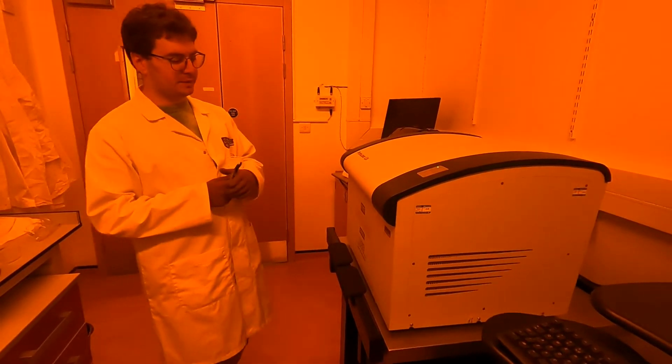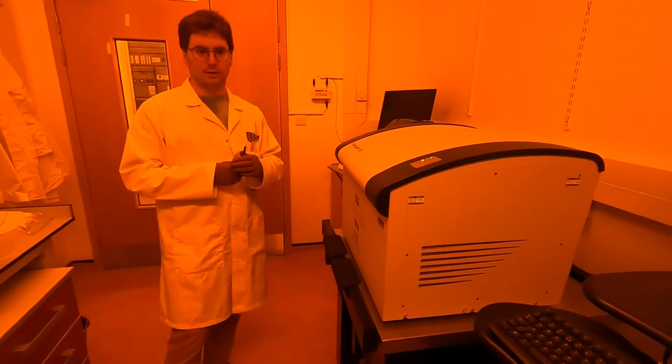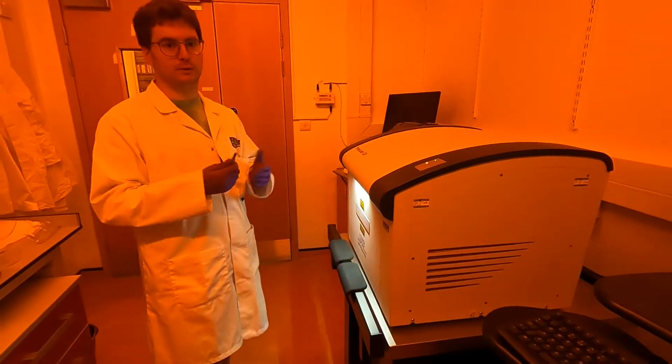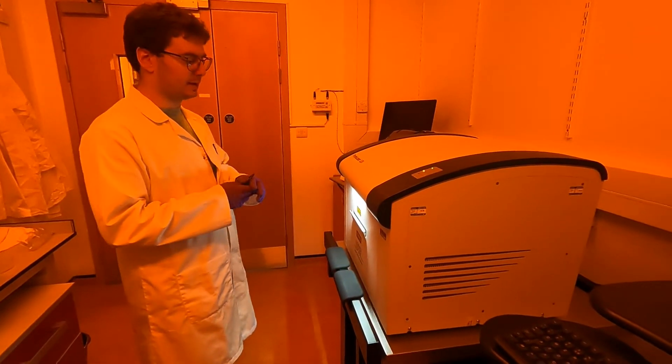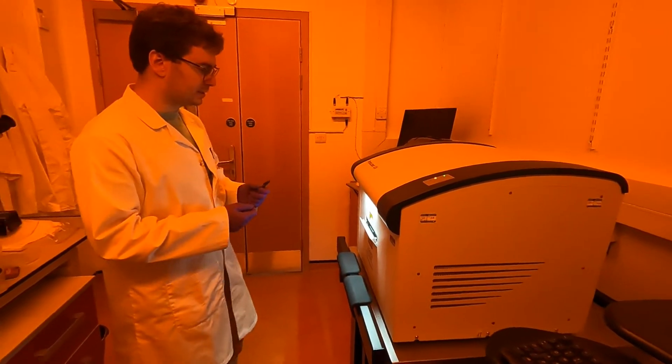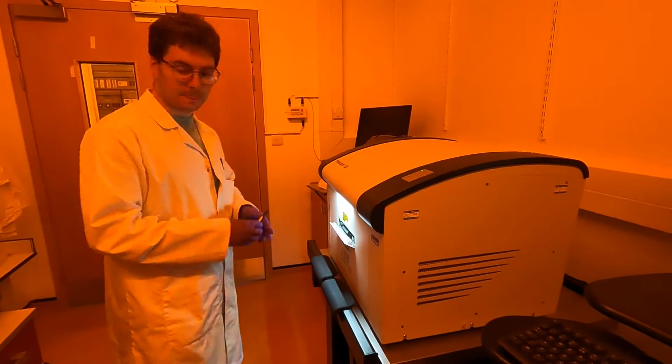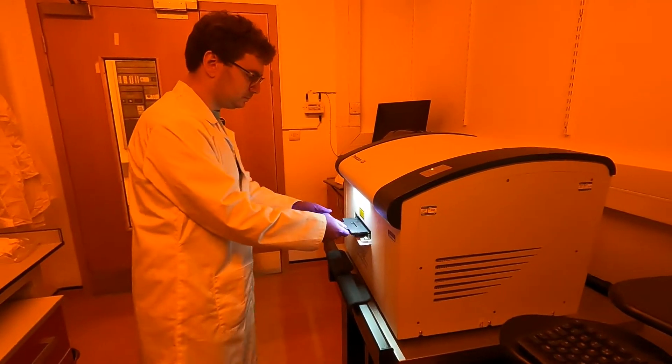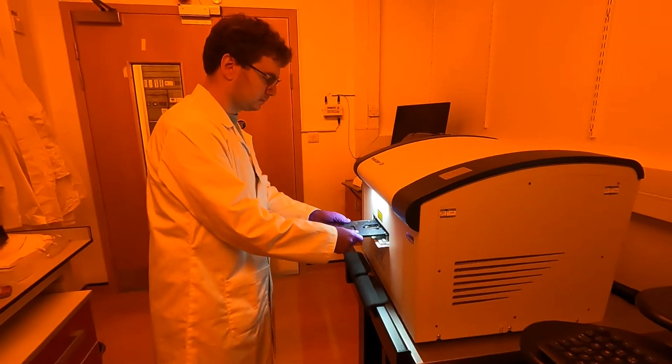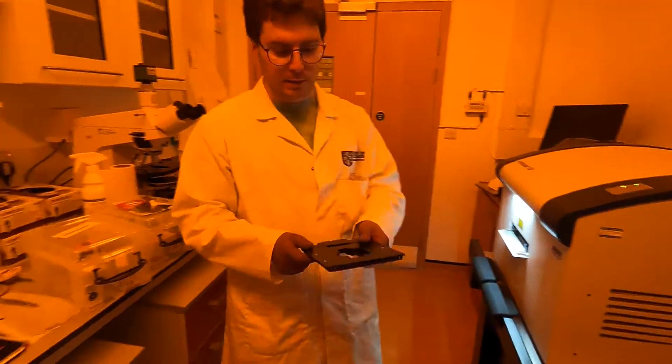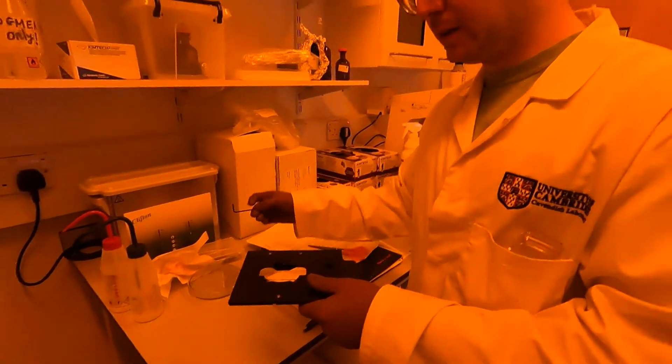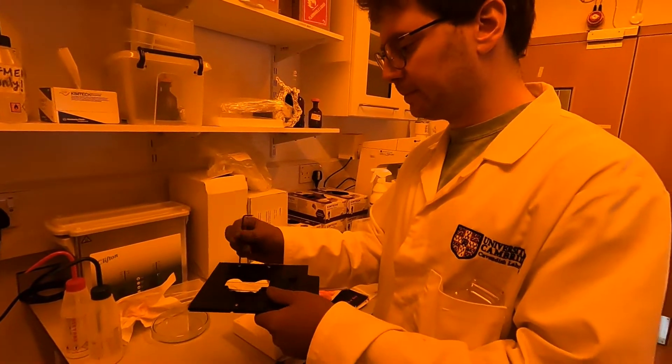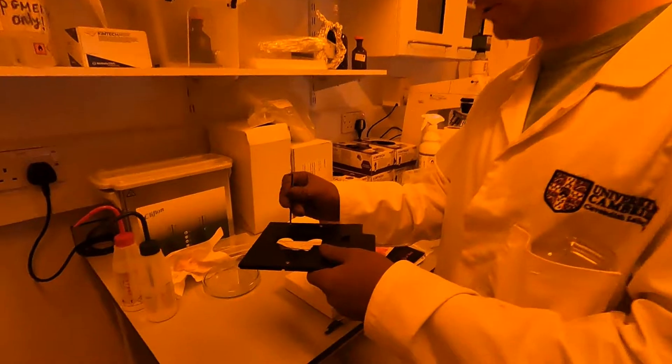The following step after this will be to take it out to develop. We will undo the screws and move on to the post-exposure bake step. The sample is now ready and coming out. Remember that the film is on the bottom side facing the floor, so we need to flip it over. I'm going to undo the screws first.